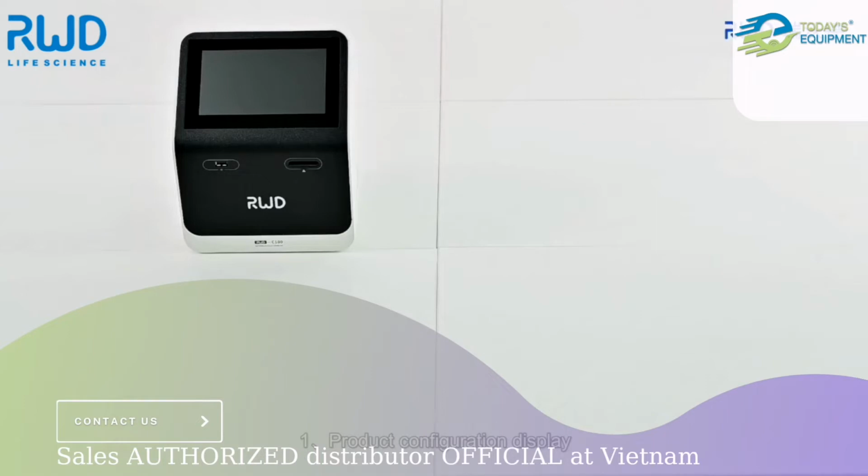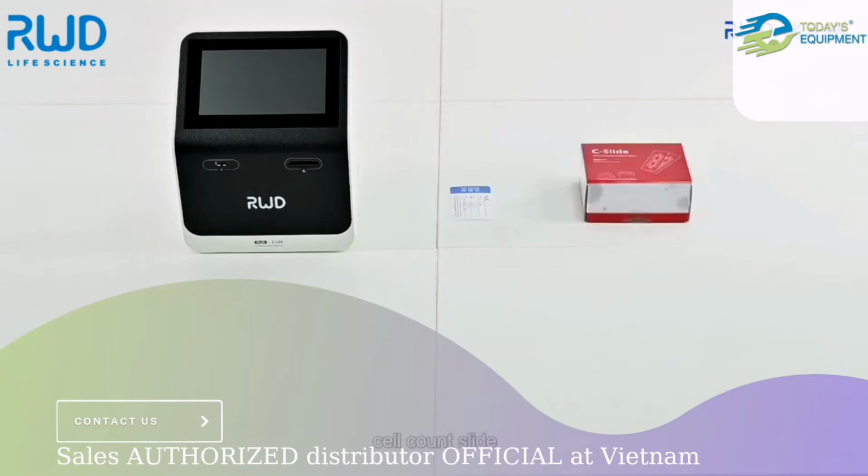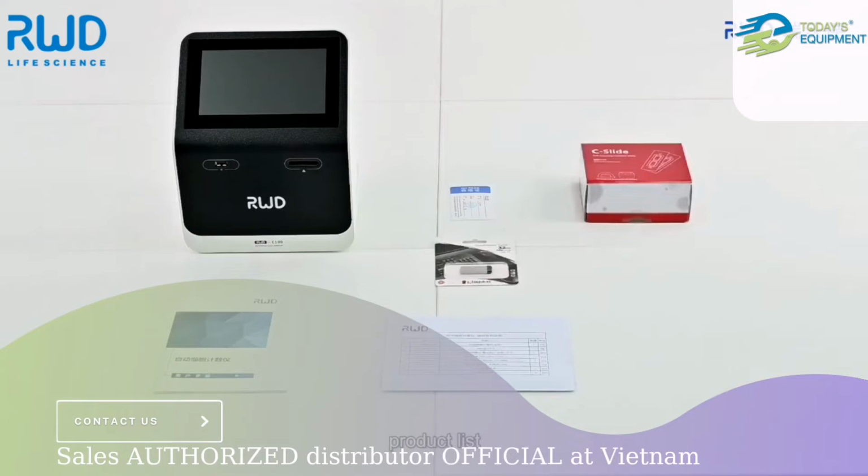1. Product configuration display. Automated cell counter. Product certificate. Cell count slide. USB disk. User manual. Product list. Power cord and cell dye.